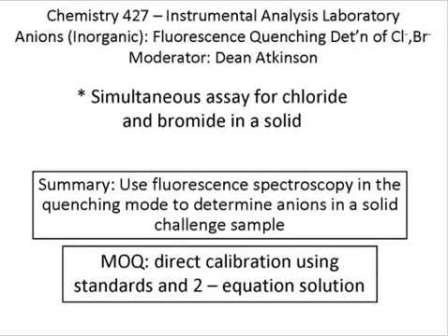I'm presenting the fluorescence quenching determination of chloride and bromide lab. That's in our inorganic, our anions pair for our Chemistry 427 instrumental analysis lab here at Portland State University.